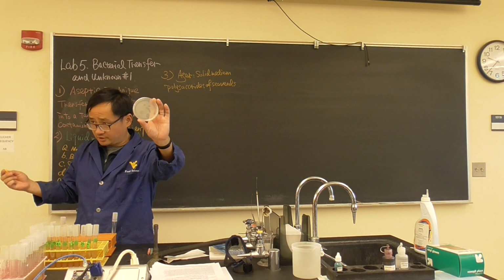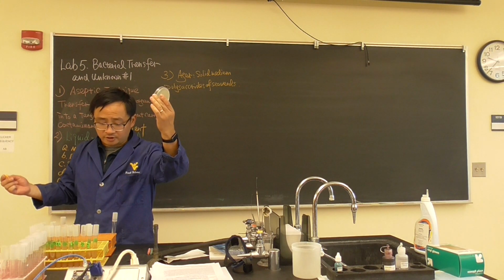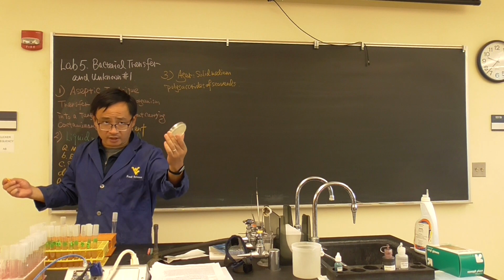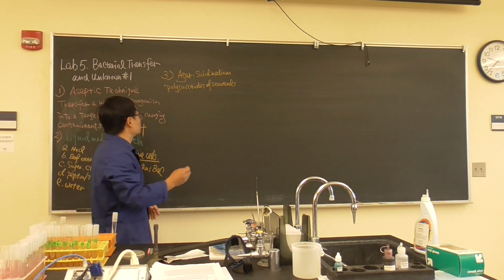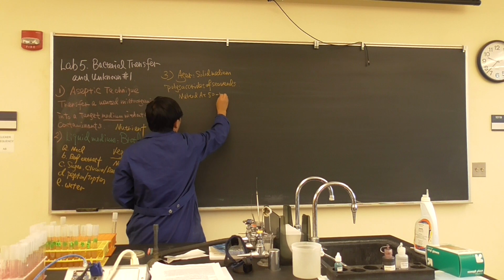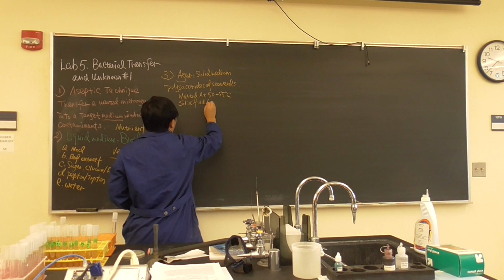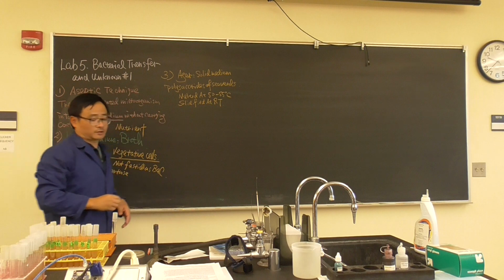Miss Fanny Hesse was the first person to find that the polysaccharides from seaweeds make agar a good material, because it melts at 50 to 55 degrees Celsius and solidifies at room temperature. This is very important.